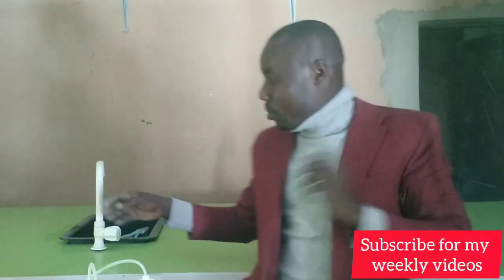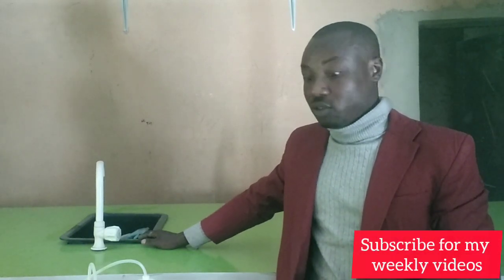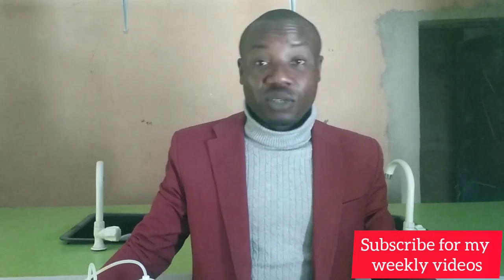So this is my lab that we have 3, 1, 2, and 3, 1 in the front. And we have running water as well. So this is just a mini lab for minimum of 6 students and maximum of 12 students. It's just a mini lab. We also have the physics lab, the agric lab, and the biology lab. That even if we arrive for practical, we can share our students into 2. I believe this will be of help for you.